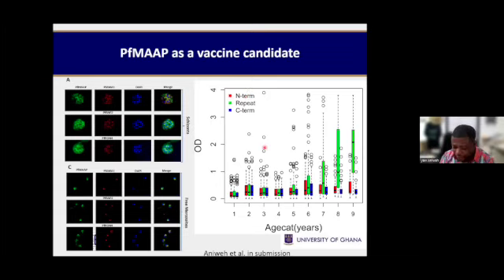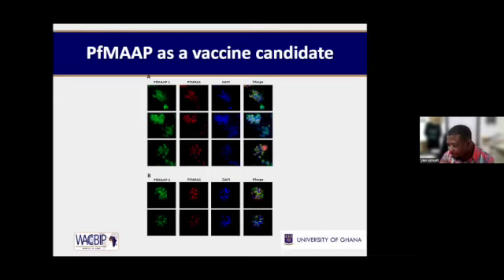And here we can show that the C terminus is mostly associated with protection relative to the N terminus and the middle repeat region. The other thing we could show here is that when the parasites are intact, it shows the perinuclear pattern, but towards them being released, like you can see in this case, the protein becomes more concentrated. And in this clear demonstration, you see that it's more apically concentrated. So here with imaging, we can see the dual behavior of the protein. When it is in the intact parasite, it is perinuclear. When the parasites are released as individual merozoites, it becomes apically concentrated.